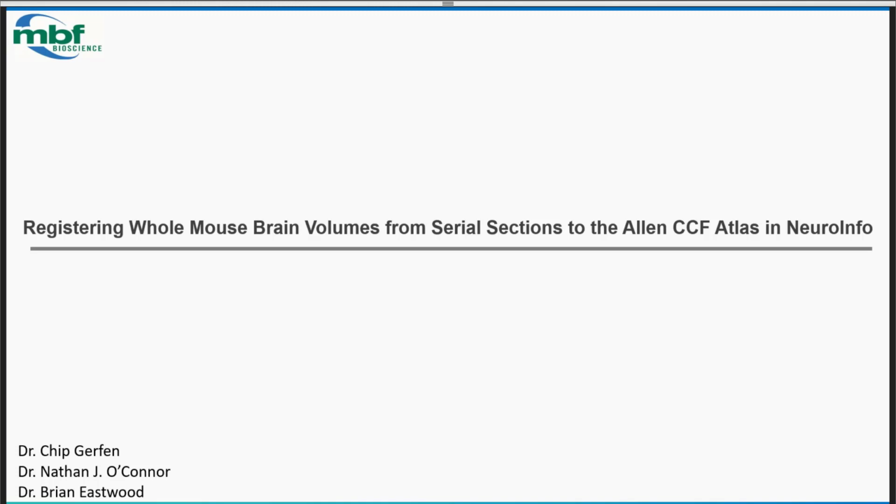I do want to remind people that this is one in a series of webinars about this topic of mapping brain volumes into an atlas reference space. Our last couple were really general overviews, and they're available on our website, the MBF website, under resources. I'll give an address at the end too. But this one, we're going to run through a certain part of the workflow. So we're going to do a deep dive here.